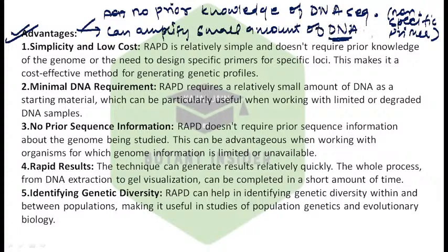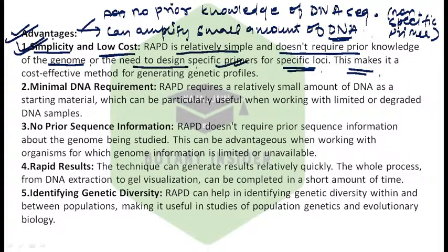Okay. It has simplicity to it because the procedure, when compared to RFLP and AFLP, is relatively easier and it is cost effective also. RAPD is relatively simpler and does not require prior knowledge of the genome or the need to design specific primers for specific loci. This made it a cost effective method also.